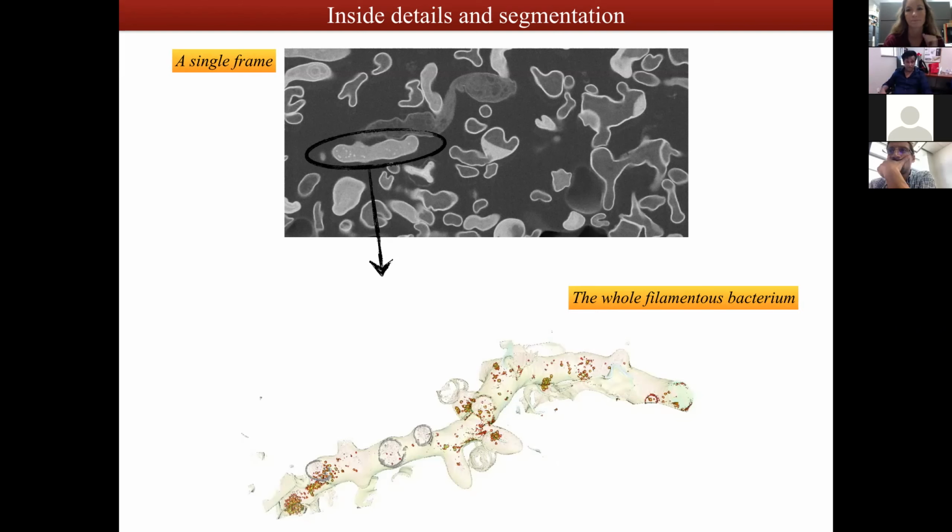Before going on, let me see, somebody has put a question. Julian Feng says, have you stained your sample? If yes, before freezing your sample or after freezing it? So Julian, we do not stain our samples if you're doing cryo, okay? If you want to do staining, you have to stain the sample while doing the cryo. What we call that is cryo-negative staining.